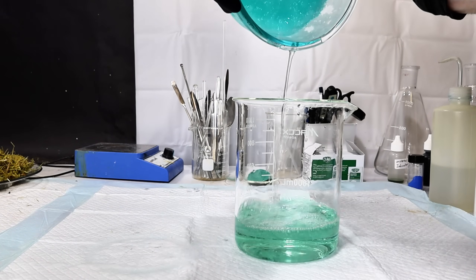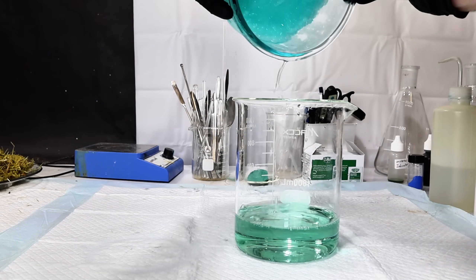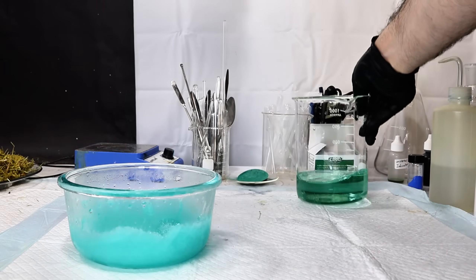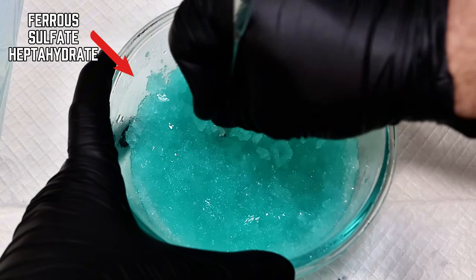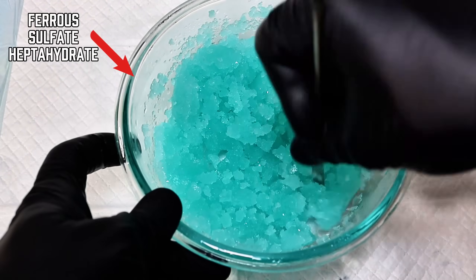Once the iron sulfate did finally crystallize, I did my best to break up the big pieces and then passed everything through my Buchner funnel to collect my pure iron 2 sulfate heptahydrate.